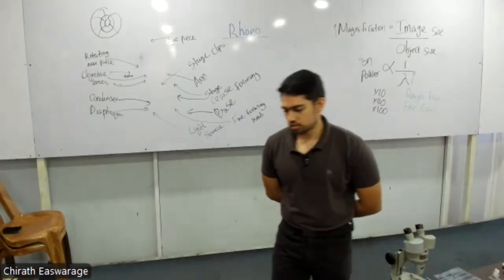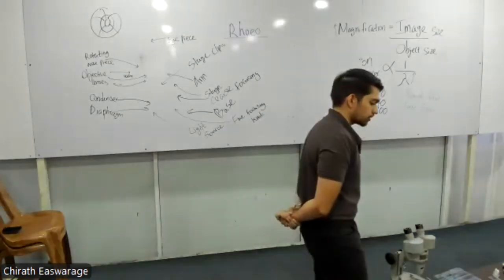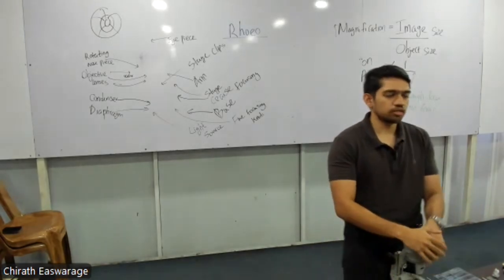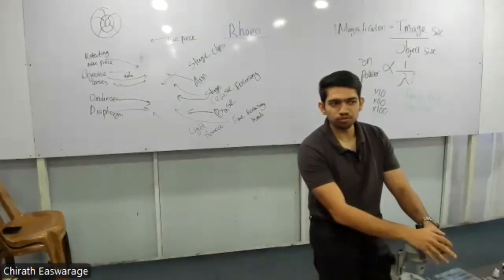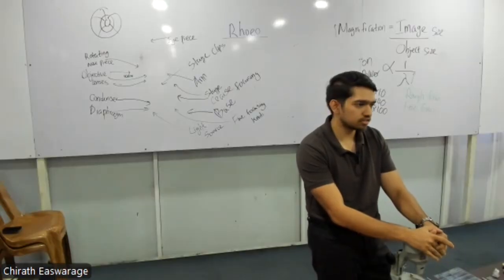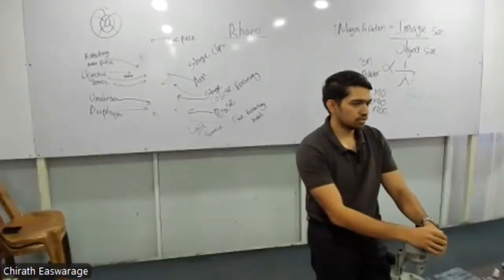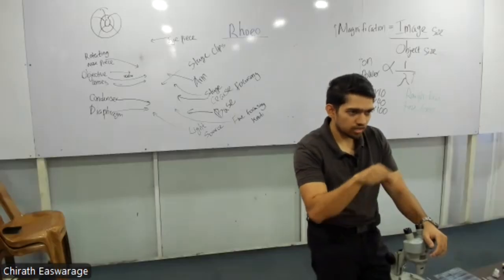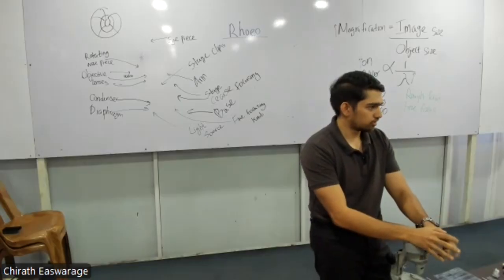Dyes are used to stain, right? So in the next part, that is the cellular basis, I'll tell you about this staining, right? There are several dyes that we can use to color these cells nicely so we can easily observe them. Usually we are using this onion and rhoeo here because why? They have a nice natural color, right? Pink, rhoeo has also like a purplish color we can see. But if you observe some, let's say, bacterial cells, they look colorless, right? And just a water droplet, they look colorless. We have to use some special dyes so that we can color the special structures in different colors so that we can observe and identify the structures.